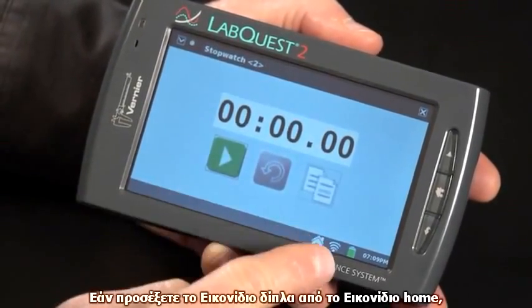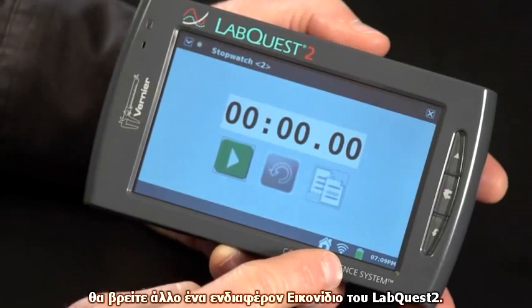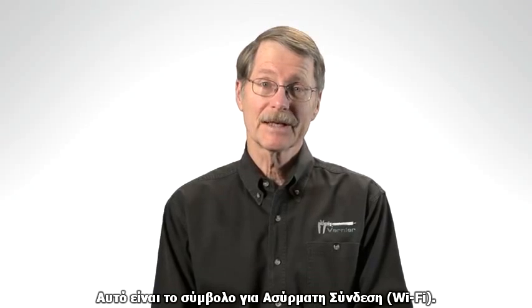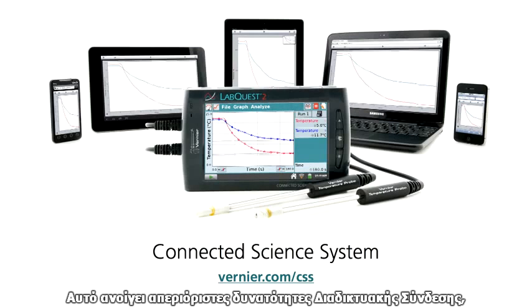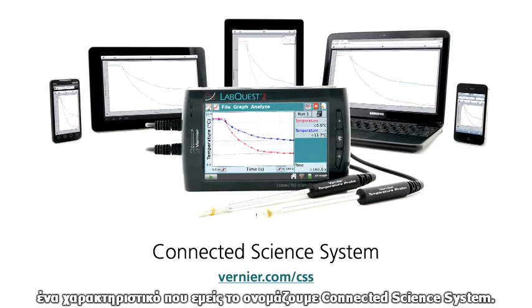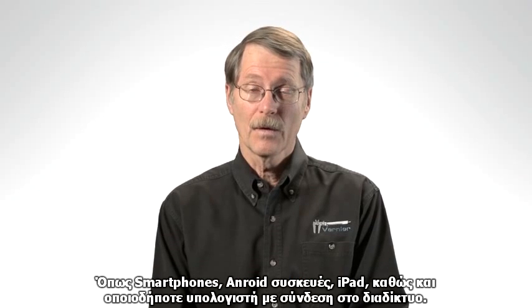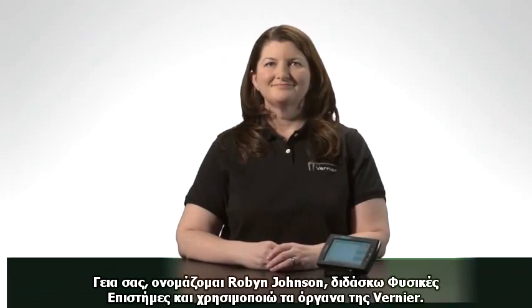If you look right next to the home icon that we've been using, I think you'll see another interesting icon. That's a symbol for Wi-Fi. LabQuest2 has built-in Wi-Fi, and this opens great possibilities for something we call the Connected Science System. A LabQuest2 can broadcast data to any device that has a browser, and that can include smartphones, Android devices, any other computer, or even iPads. And you'll learn more about that in the next segment.